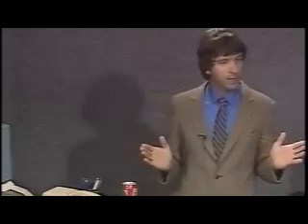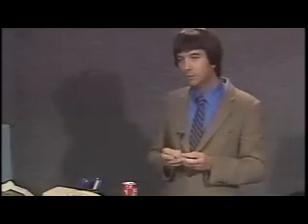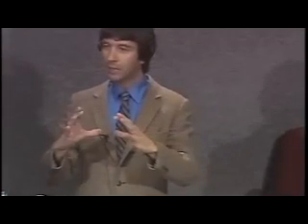Obviously, the electric field is not uniform everywhere on the surface. It's highest at those edge atoms. So when the evaporation field was reached for whatever metal substrate we're interested in, those edge metal atoms would evaporate first, because that's where the field is the highest. Right? And they'd go away. And then you'd see the edge atoms of the plane a little bit further in.